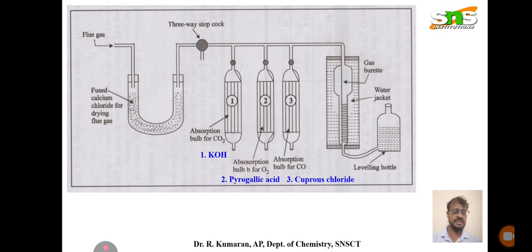We test how much gas is there. The reduction of the gas denotes the absorption of CO2, O2 and CO, etc. This is the simple method of testing how much of the pollutant is getting absorbed.